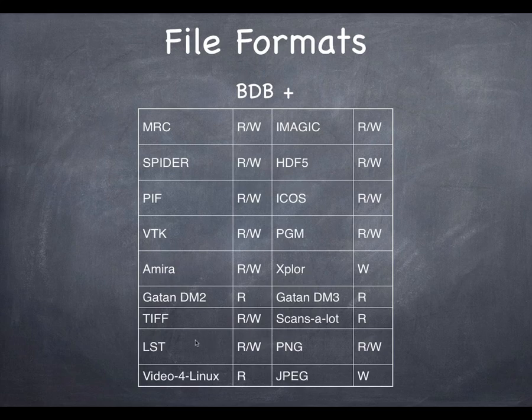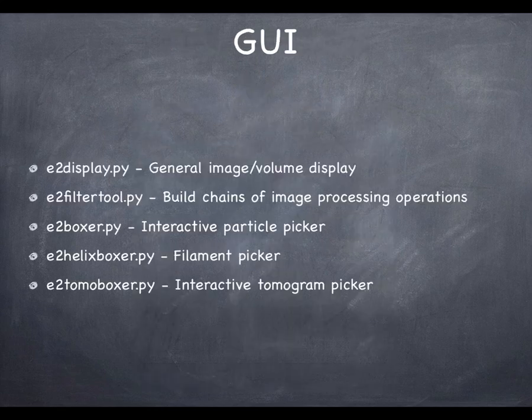We support those formats. Then down here you'll see the generic formats, TIFF, PNG. There's JPEG support, but that's write-only support. That's just for making images for PowerPoint presentations or something. As I mentioned before, JPEG, due to its lossy compression, is not suitable for quantitative image processing. So there's no support for reading from JPEG images. Honestly, if you're going to import data into the software from some other task, I would suggest TIFF is probably the most appropriate format to use.